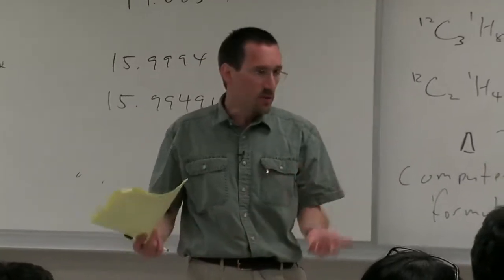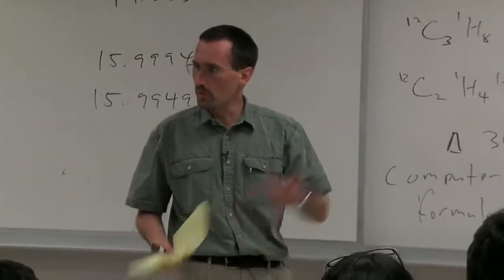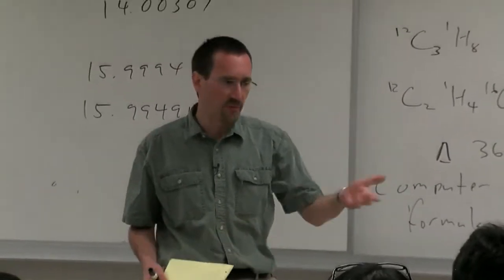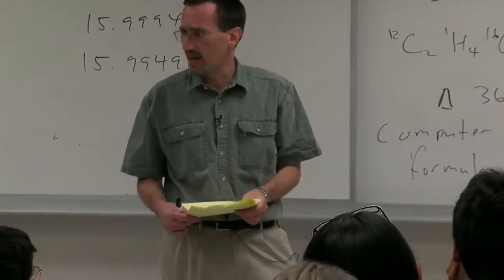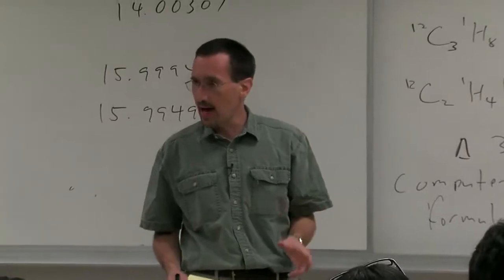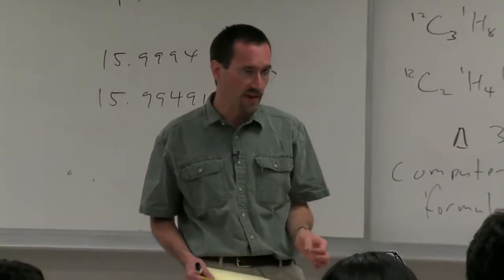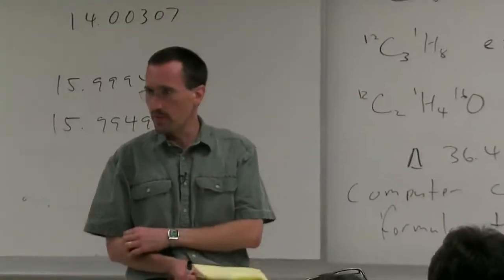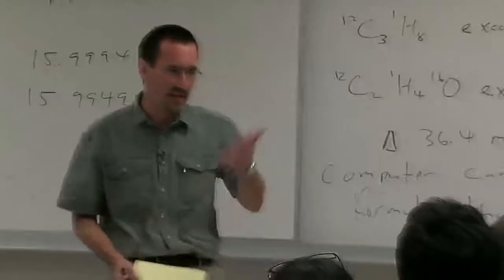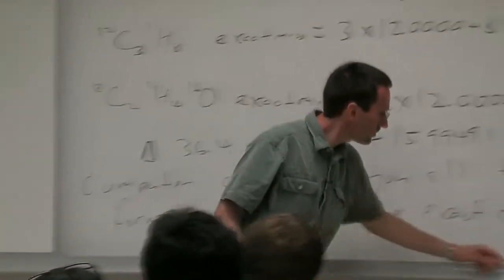And you say those compounds could have up to 10 carbons, and you'd pull down from the menu, say, up to 40 hydrogens, up to 5 oxygens and up to 5 nitrogens, and you'd find out. For a molecule this small, you'd find this is the only fit. Or you'd find maybe just a couple of fits, but then some of them would have absurd formulas like 5 nitrogens, 1 carbon, and 1 hydrogen.